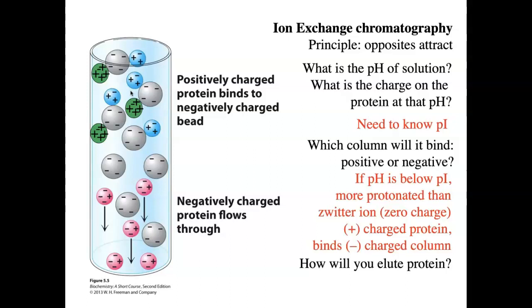And so typically, researchers will use salt because it's generally fairly gentle. With changing pH, you have to worry about protein falling out of solution or losing activity because of denaturation. But for some proteins, they don't like to be in a salty solution, and then pH is really the only thing you can do.